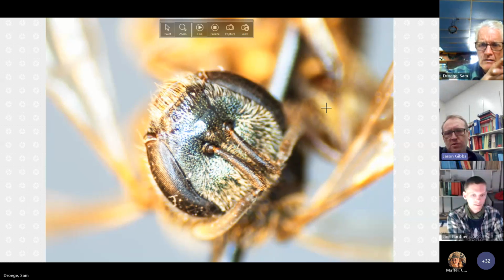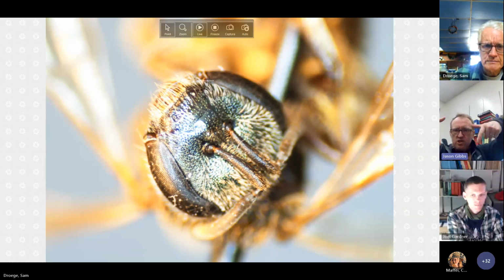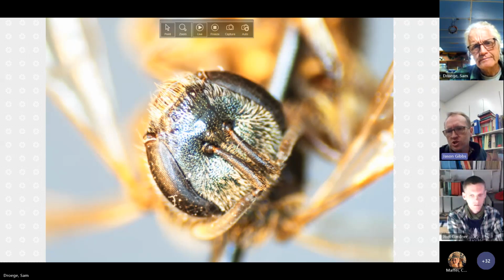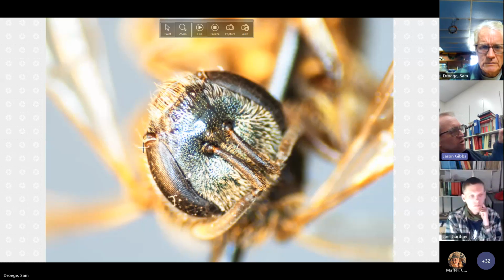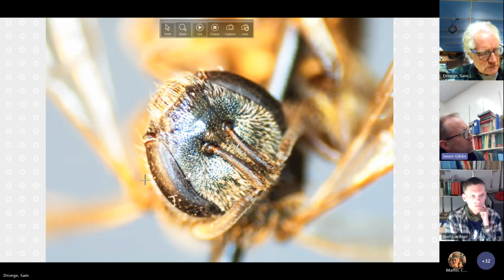Well, a typical dialectus has kind of a semi-triangular head almost, where the clypeus sticks out at the bottom, we'll see something from at random in a bit. In callidum and also in connexum, the clypeus doesn't really protrude very far below a tangent below the compound eyes.